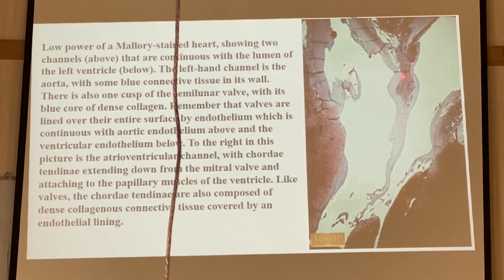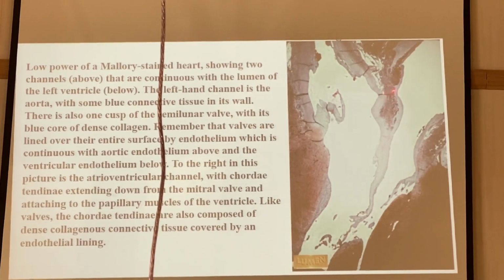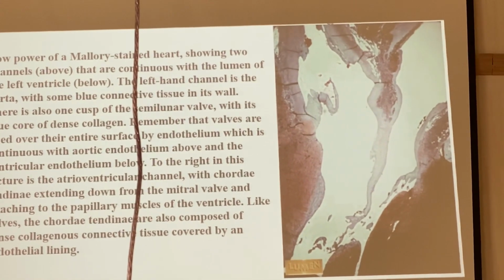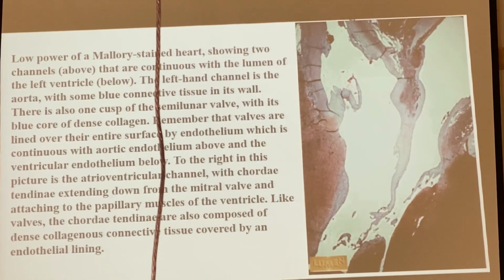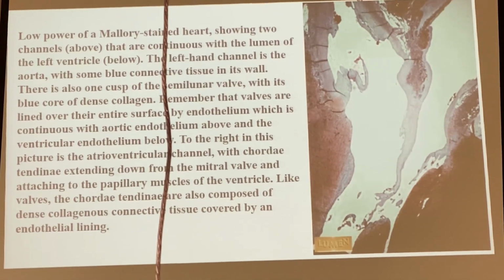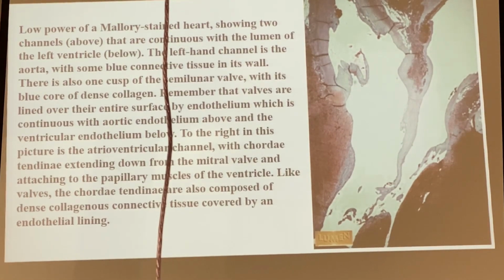Now, let us see this valve. This is the papillary muscle connected with chordae tendineae, and in this valve you will see there is endocardial lining on both sides of the valve, and the core of the valve is connective tissue, and a piece of cardiac muscle extends into the base of the valve. We said this yesterday, right?